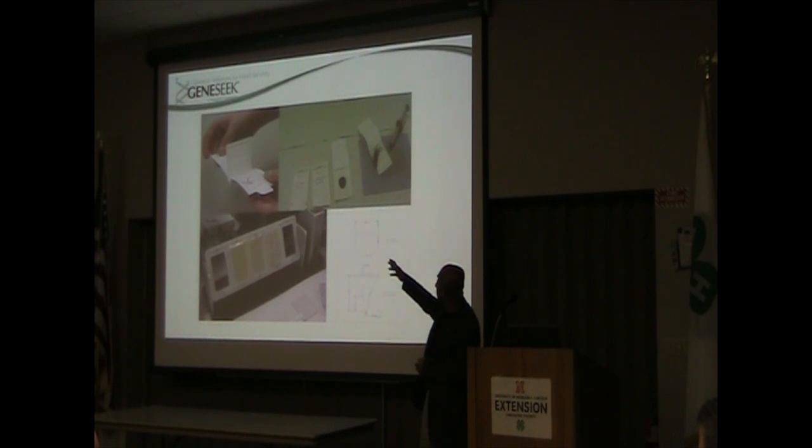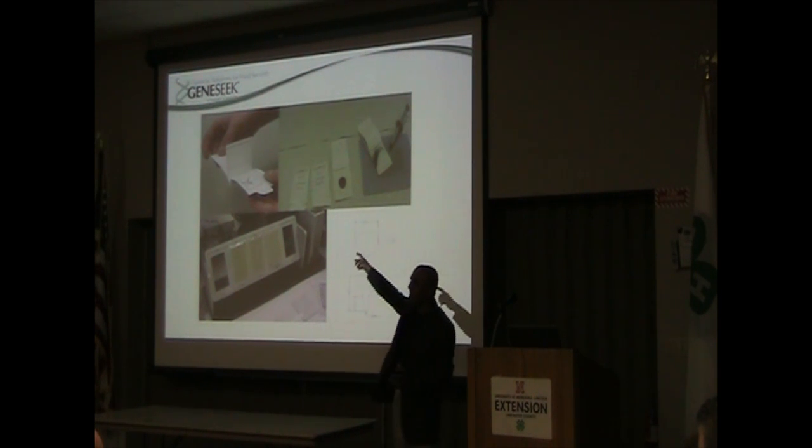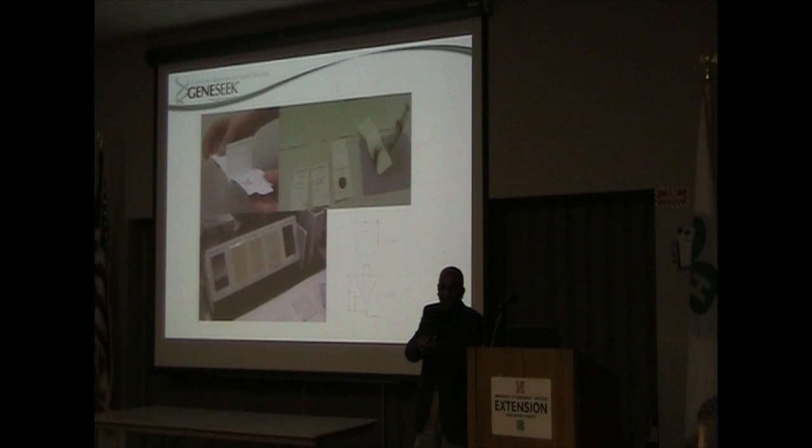One of the problems we saw in the industry was that when people send us hair samples, they just put it in a little bag and mail it to you. When it's 10, 20 samples, it's not a big deal. You can get the hair follicles out to get DNA. But when thousands of them show up, it'll drive you crazy, because they fly all over the place. So we came up with this little device where you can stick the hair and seal it and send it to us. We can just punch through the device with the paper and the plastic, everything, and still get DNA out of it.